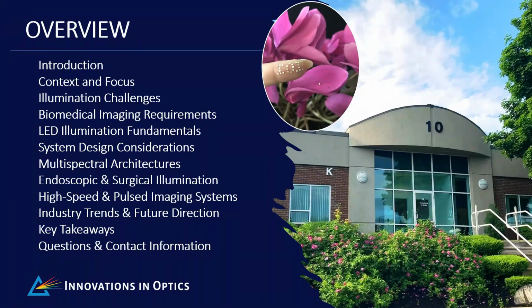We'll then examine how those principles are applied in real biomedical instruments, including fluorescence imaging systems, PCR instrumentation, multispectral imaging platforms, and endoscopic illumination systems. And then finally, we'll discuss emerging trends in biomedical imaging and where the future opportunities may exist for spectrally programmable solid-state illumination technologies.